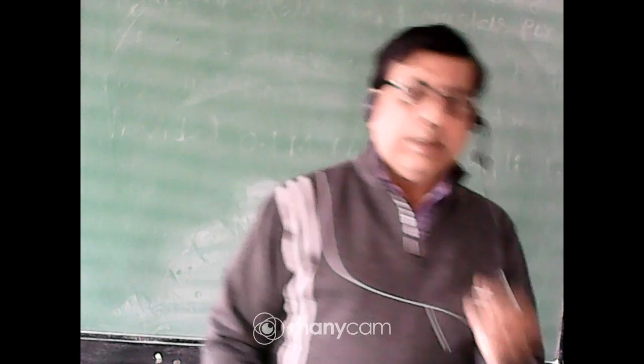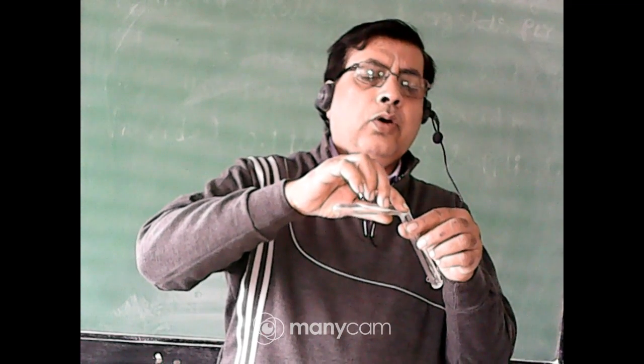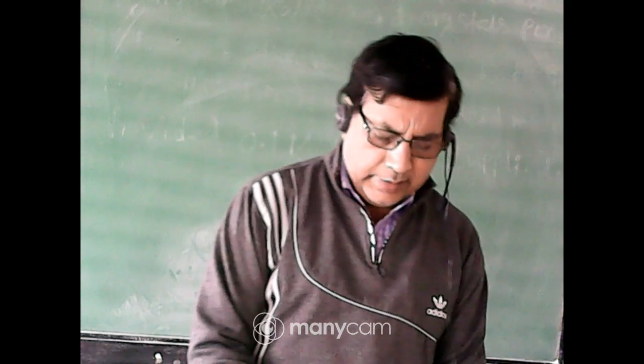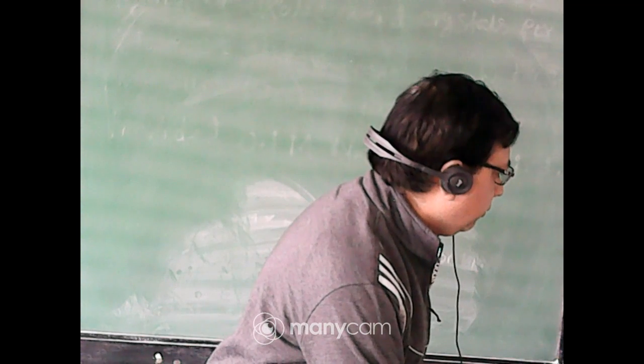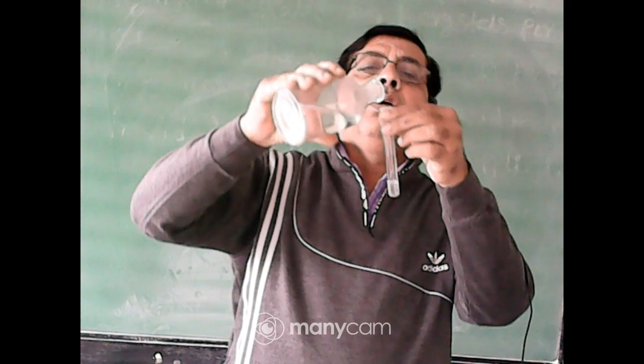Now you reject the solution, wash the test tube, and again take a small amount of original solution. Then you add barium chloride solution.